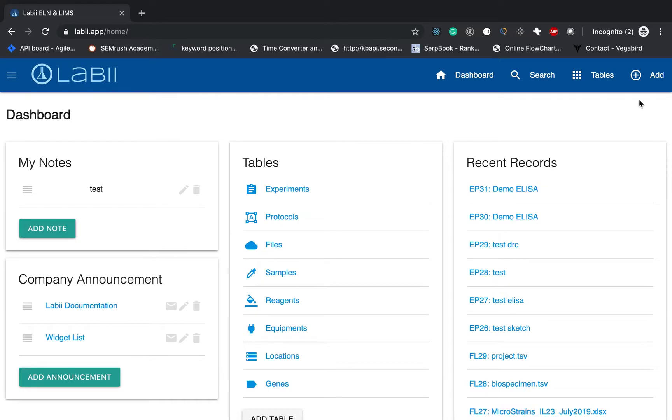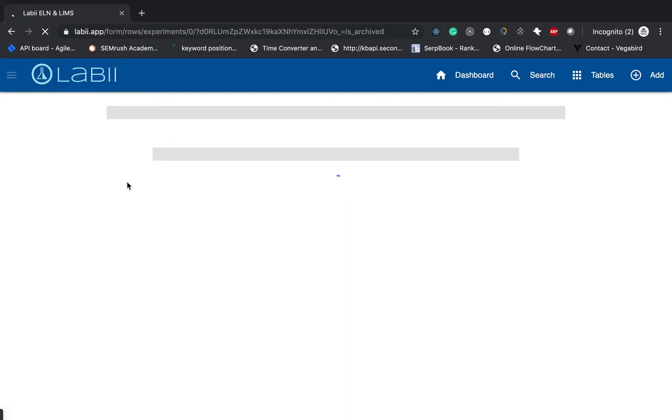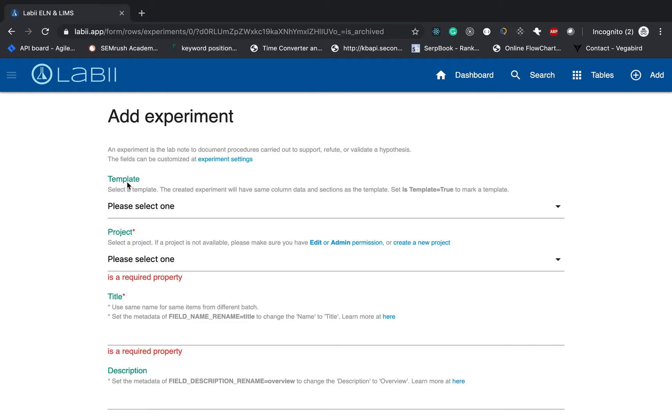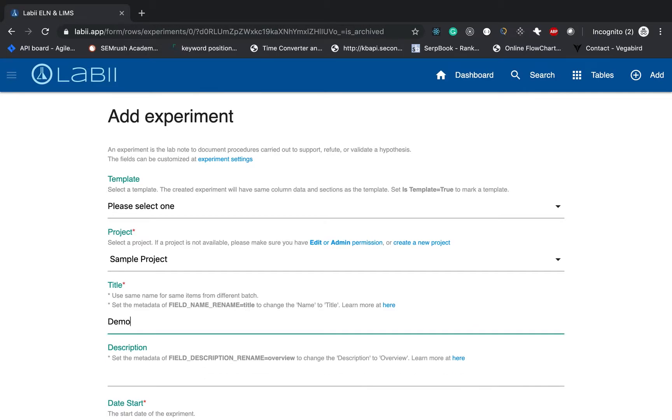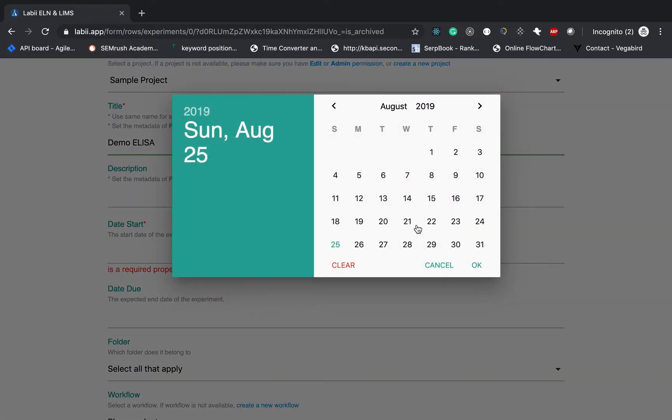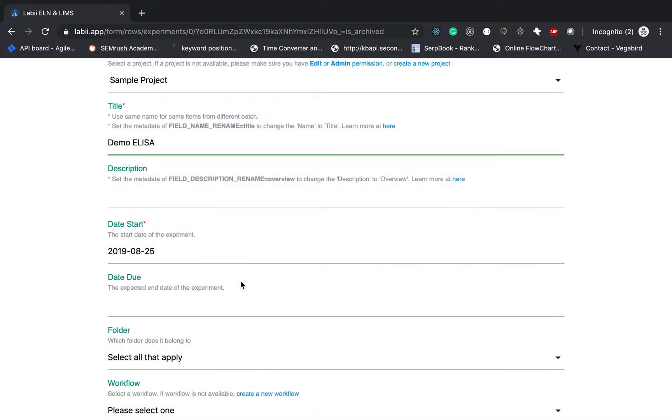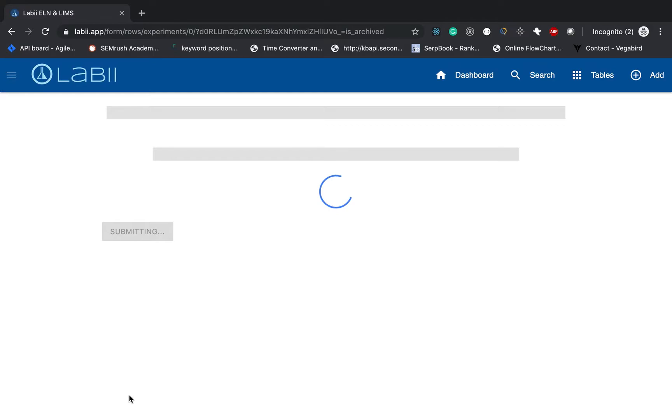To do that, the first step will create an experiment. Under the project, just select one project that fits you, and then the title I will just say demo ELISA. Choosing the date of the start. Then click submit.